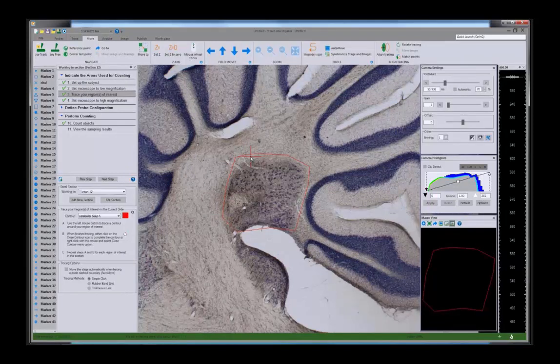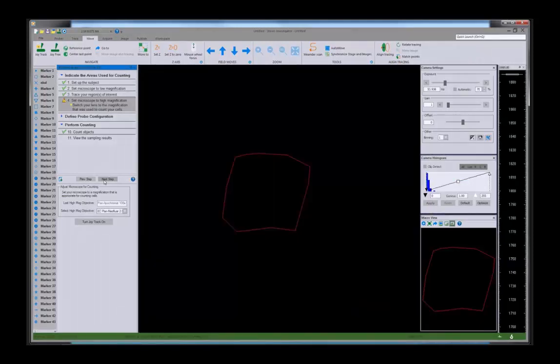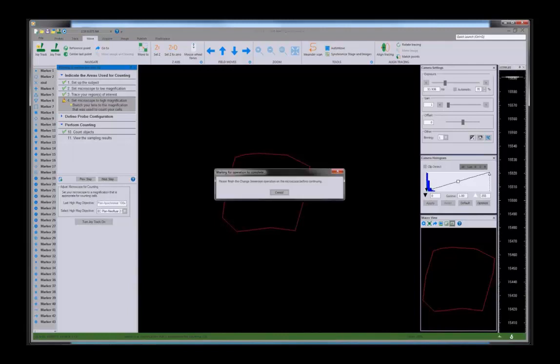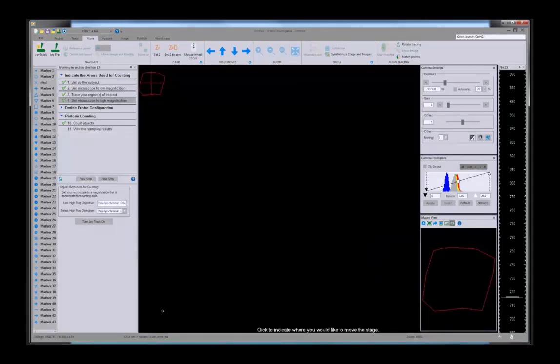There's a little bit of oil left on the ×100 objective. I put a little bit more oil above section 12. We go into the oil and take a look at the macro view. It's showing us that our field of view is outside the region. So I can go to the Move tab, do a Go To, get ourselves somewhere in where these cells actually exist. Click there. Okay, now I see the cells.